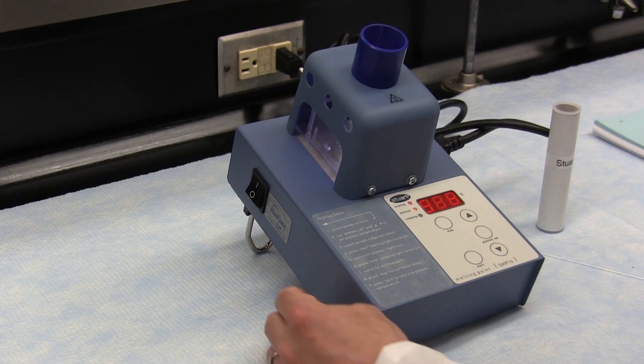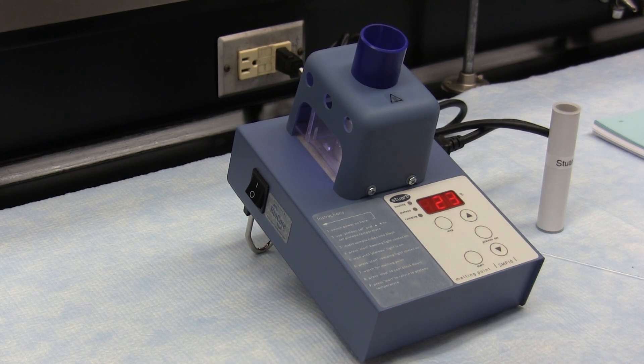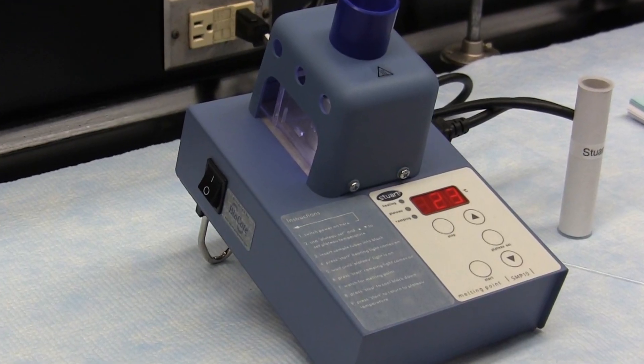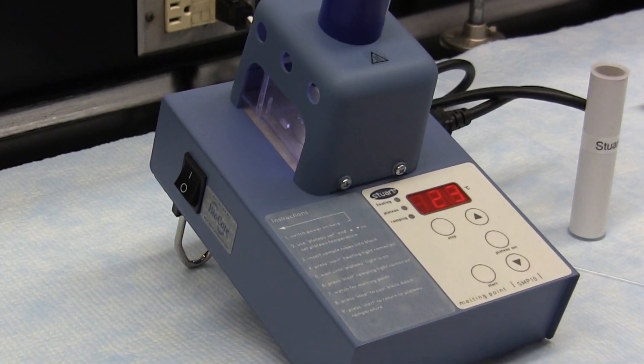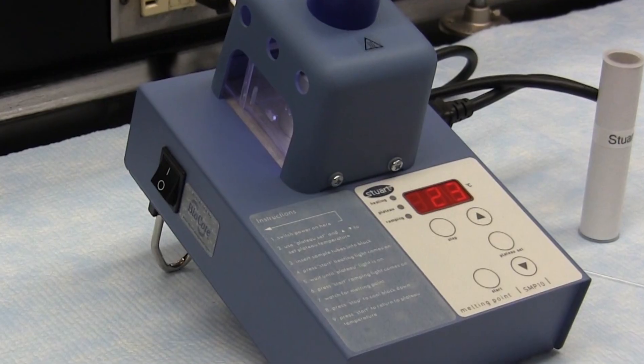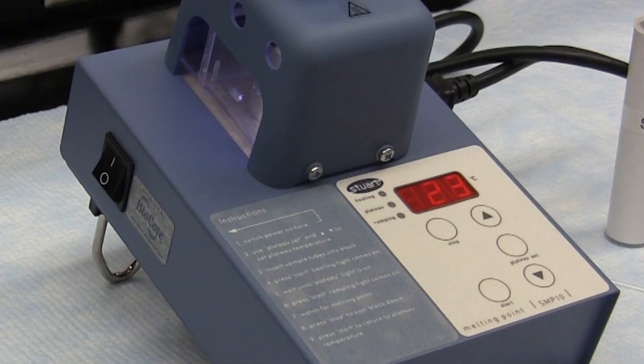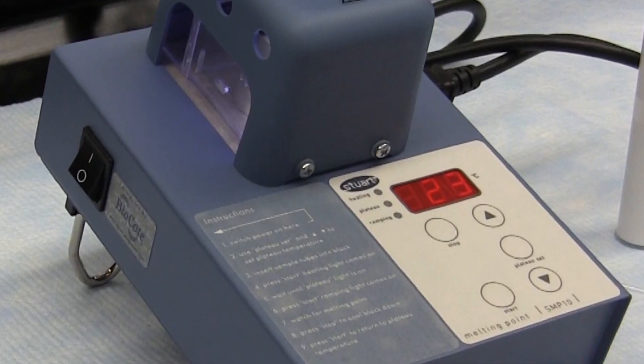When a unit is plugged in and switched on, the LED display will show the actual block temperature and the sample chamber will be illuminated. If the unit has been used recently, the block may be too hot for your sample. If this is the case, press the stop button and allow the unit to cool before proceeding.